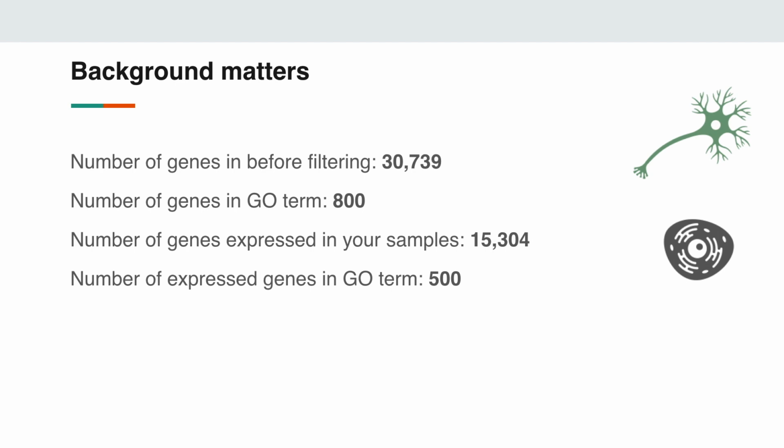And the last thing that I want to mention is that for this kind of analysis, it really matters the genes you choose as your background and test. For example, Albert touched on this a little bit when he was introducing you to GO analysis using the browser. And what it means is the background set can be either the total set of genes you quantified.